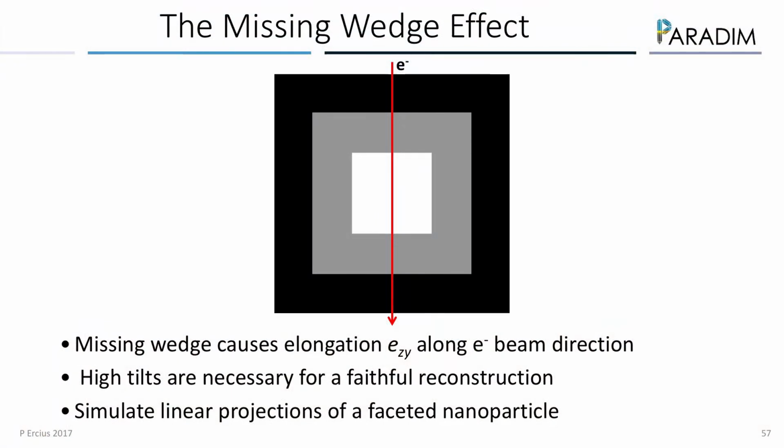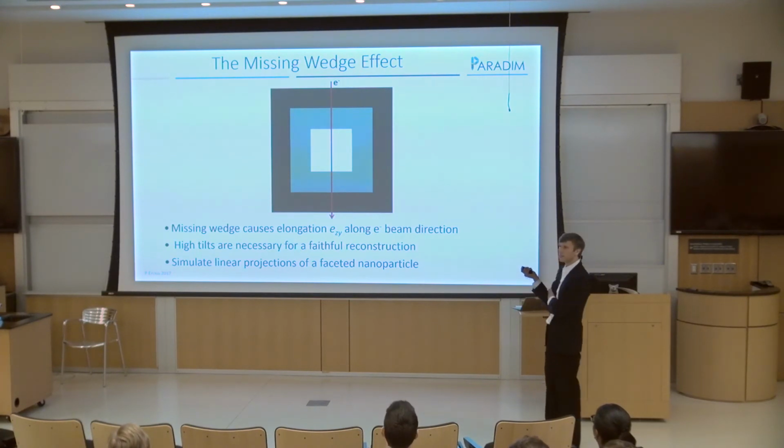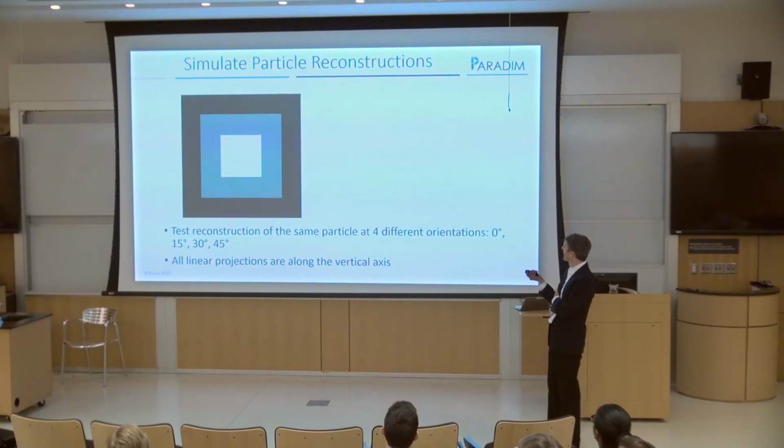But a lot of things that people are doing now are looking at these nanocrystals, and they want to look at facets of these nanoparticles, OK? So faceting on a nanoparticle is really important for catalysis, for how they work. But tomography has some interesting effects, theoretically, on that, OK? How does this affect the shape of this?